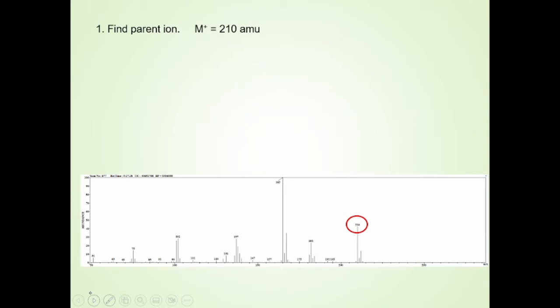And then we can also look at common ions. Now this one, I've got something a little bizarre written here. The mass at 111, if you work with halogenated aromatics, that would probably be a common ion for you, but if you don't, this would not be a common ion for most people.